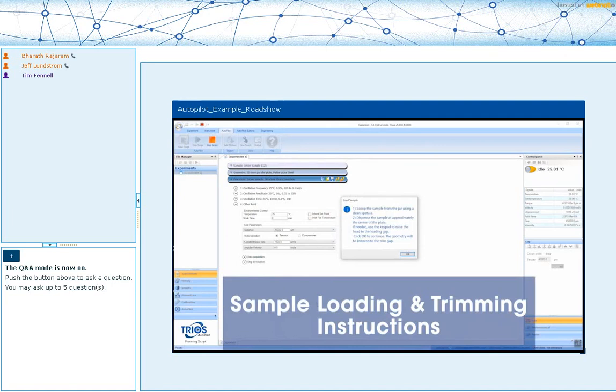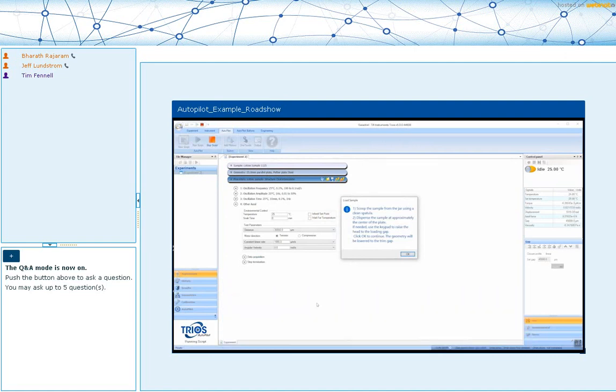And this is particularly important when you test at high temperatures, when you're doing polymer melts. You might be testing at 180, 190 degrees, and you want to ensure that the geometry has equilibrated. Then we can go through and do the zero gap calibration. You can see the gap decreasing. So that happens.